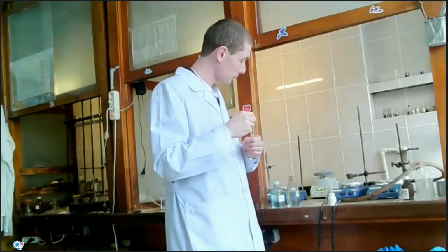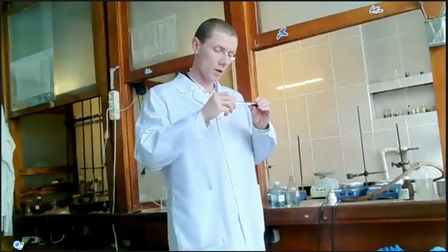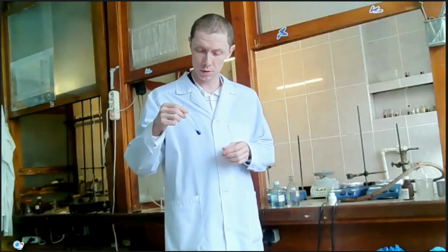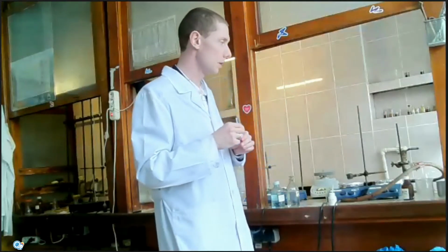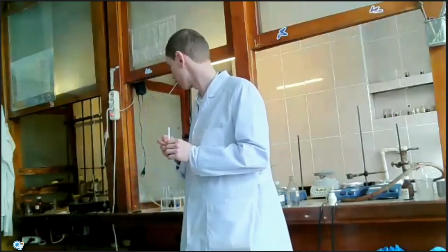To obtain this product, you should use the crystalline ammonium thiocyanate, because if you use a solution of this compound, because this reaction is reversible, you cannot obtain the product in useful, large amount.